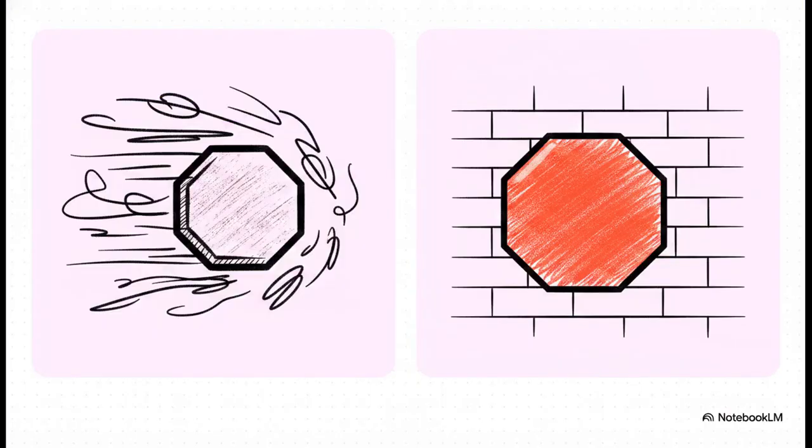Let's zoom in a little closer to see what actually happens inside one of these theoretical frames, or plates, as a substance, which we call an analyte, progresses through the column. In this model, an analyte experiences two entirely distinct states during its total migration time. First up, you have the time spent in the mobile phase, where the analyte travels at the exact same speed as the fluid. And second, there's the time spent in the stationary phase, where the analyte is completely immobile. So it's a totally binary experience. You're either moving at full speed, or you are completely stopped.